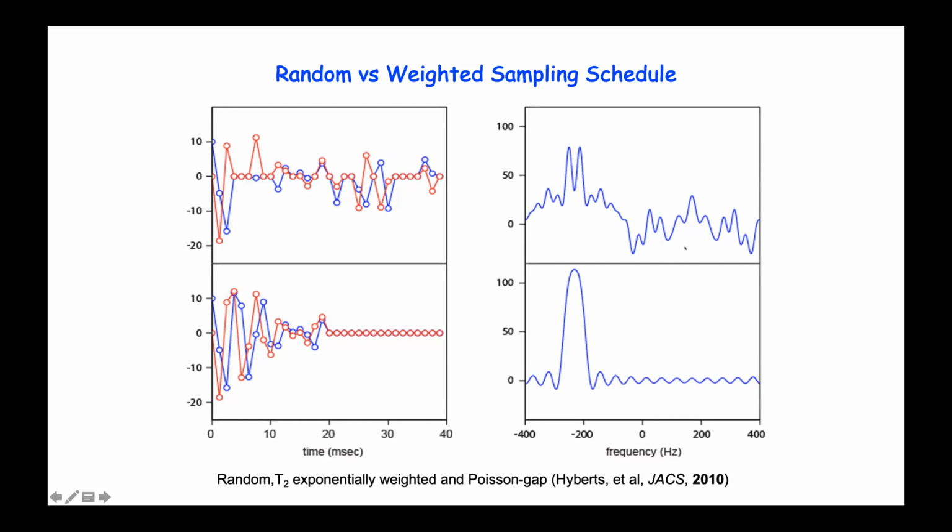When I look at some impact, I look at the extreme case. In this case, the extreme case is a 50% complete sample, random sampling, which is 50% of the first data points, the first part, and the NUS is really completed; the second 50% I set to 0. And you do the Fourier transform, and you see a nice peak. It's stronger, and the artifact level is also lower but coherent. This is really the truncation effect.